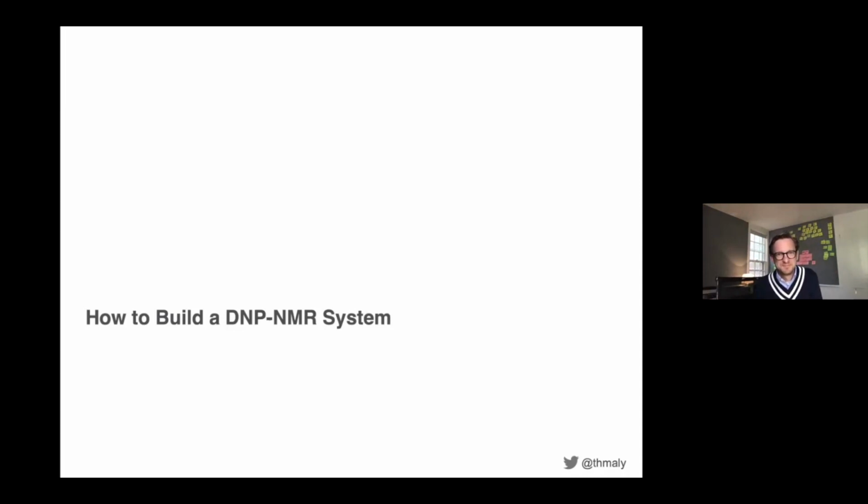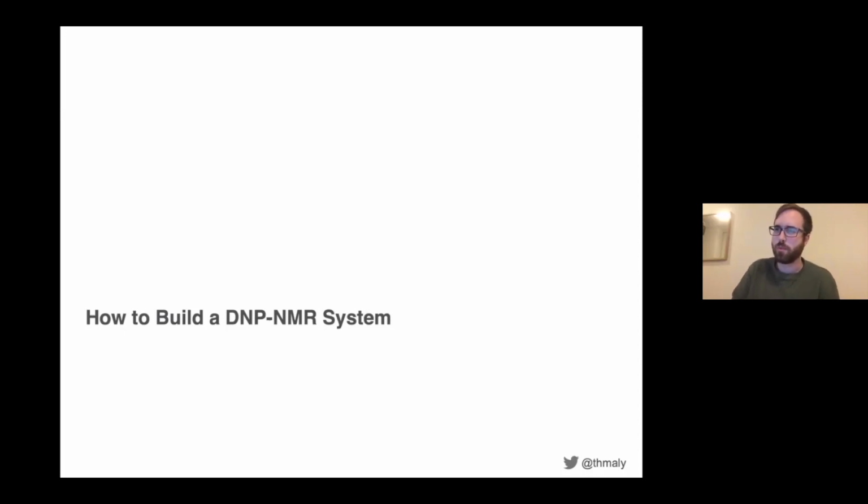All right. We'll do one more before we continue the talk, and then we'll address the rest of these questions at the end. From an anonymous attendee, they're wondering, could you explain in simple terms how the corrugation helps to minimize the microwave power loss, and how the corrugation pitch is related to the wavelength?